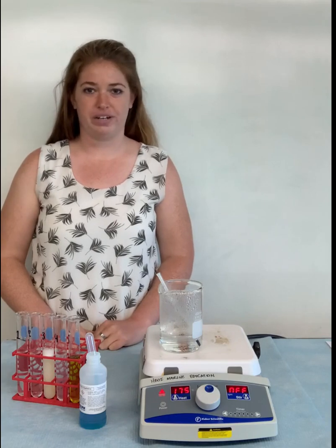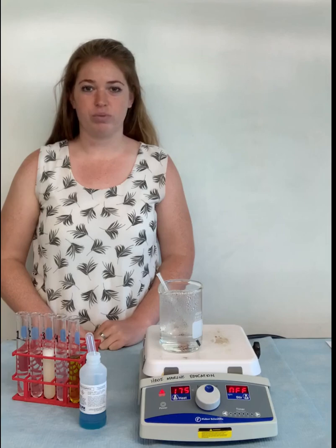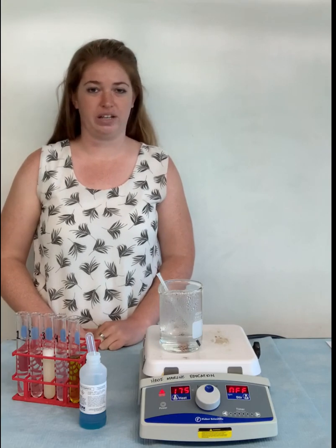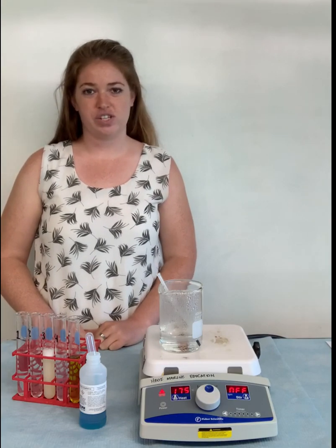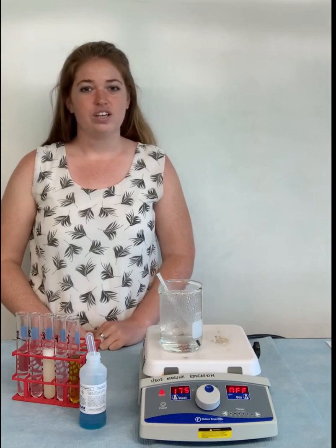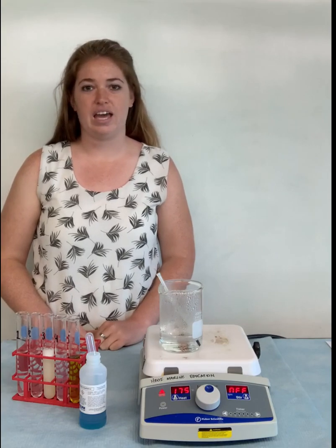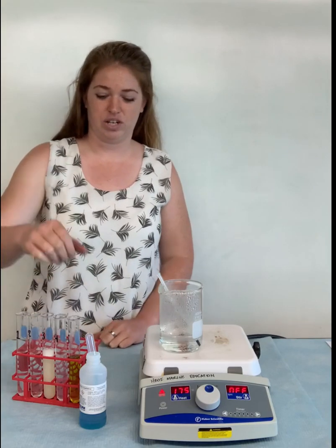the presence of monosaccharides. Now, monosaccharides is just a long word for simple sugars or small sugar molecules. These are the types of sugars that you would find in candy, soda, any of your sweet treats. So we are going to test for these monosaccharides by using a reagent called Benedict solution.